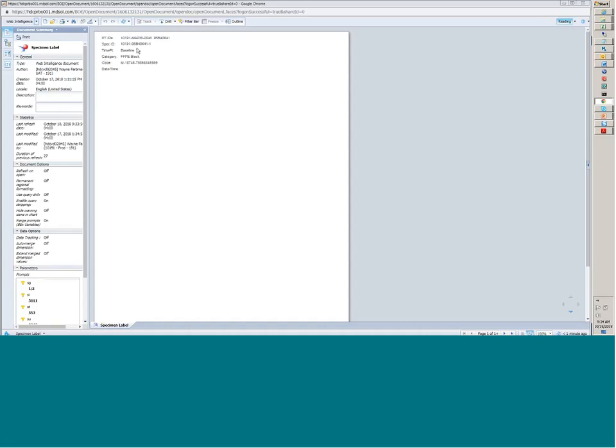This label is a 1-inch high label and 2.625 inch wide. It's a standard size Avery mailing label. Might be a little bit big for certain containers, and we'll be doing our best to try to shrink it down. But right now, in order to get the data on the label that the biorepository needs, we had to go with this size, and it was the size that the Nationwide Children's Hospital recommended.